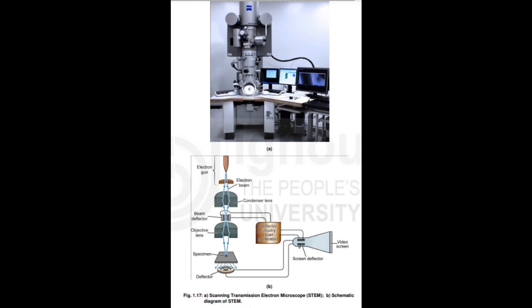1.3.3 Scanning Transmission Electron Microscopy, STEM. Scanning Transmission Electron Microscope combines elements of both TEM and SEM. STEM is a sophisticated technique and requires high vacuum conditions. It is electronically more complex than TEM or SEM, Fig. 1.17a. STEM is equipped with scanning coils, detectors and necessary circuitry.